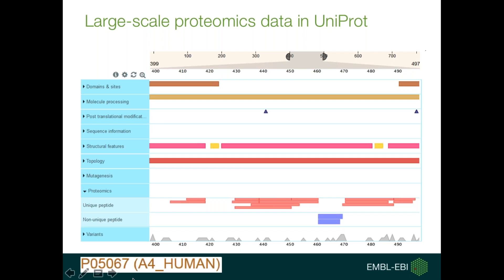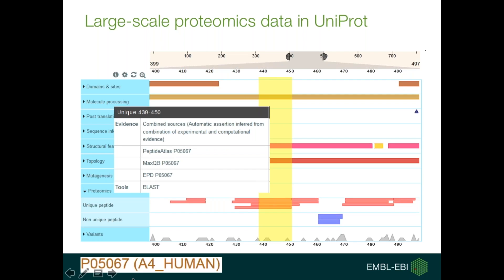Suffice it to say that this in silico dataset is species specific, which means there is, for example, a specific dataset for human. Both these datasets are combined and then used to annotate peptides onto UniProt protein sequences.